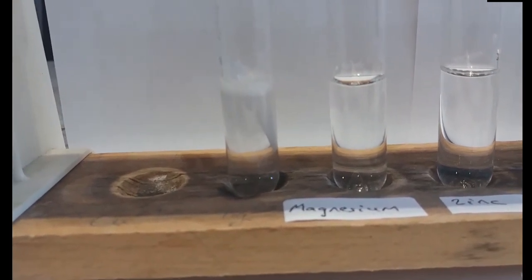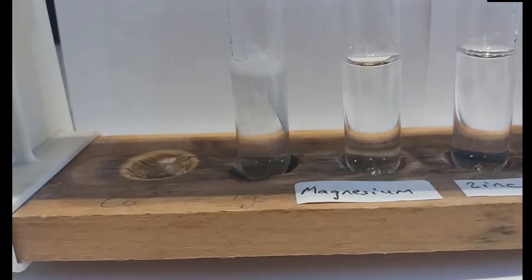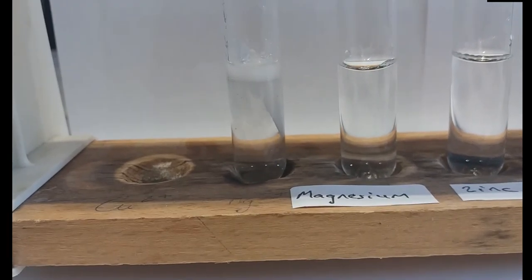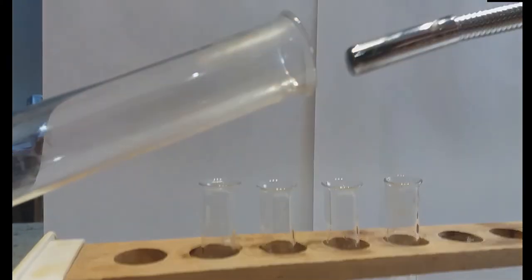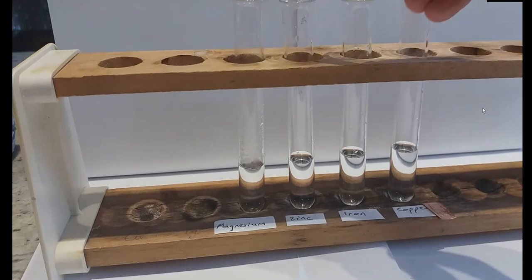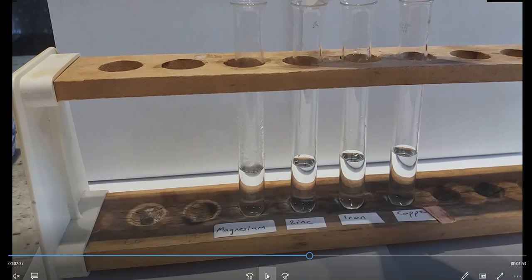I got my daughter to hold the camera. She was a wee bit nervous, as you'll see whenever the test goes off. No need to be, but it's very difficult to do. So there's the hydrogen, and you'll see that the camera jumps a little bit. It's quite a good reaction. You get quite a pop with it, and therefore that was hydrogen being given off.